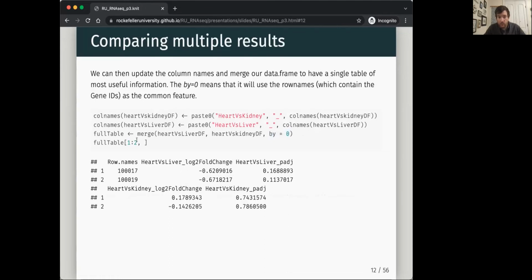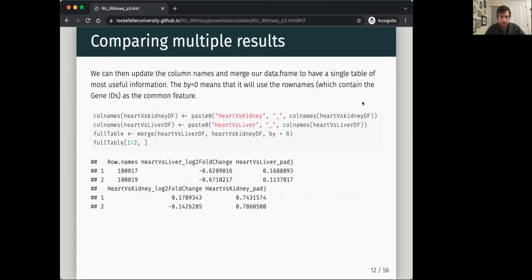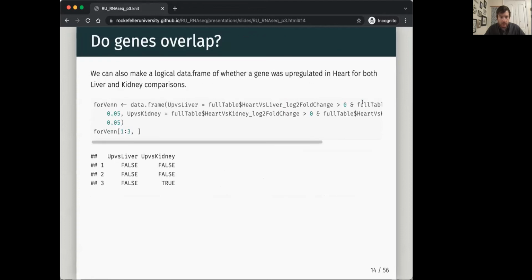When you do this and you use row names, it eventually gets converted into a column. So I can see how that output is a little confusing. Once it's been merged into the full table, it's now its own column, but before it was specifically a label. Does that make sense? Cool, that's great.